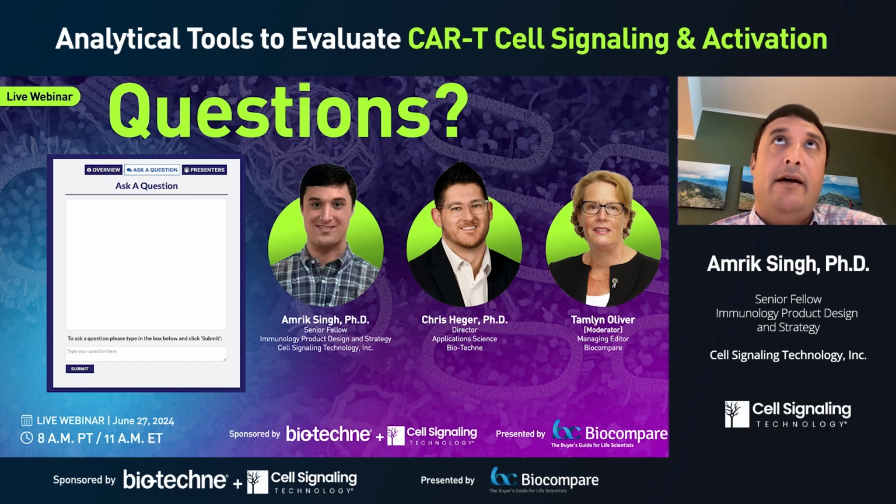So it will likely not have a great deal of utility for CARs that utilize other types of target recognition domains. As I alluded to in the talk, another class of CARs are VHH-based CARs. VHH-based CARs utilize a single-domain antibody for target recognition, and a different class of reagents is needed for those.